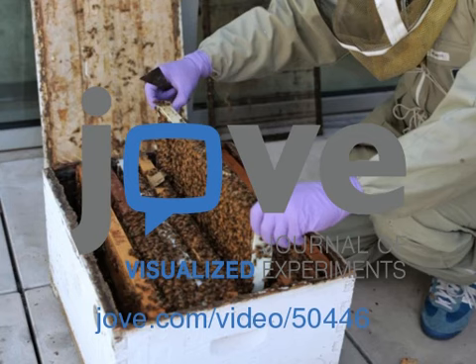While the bees are incubating, prepare a series of sucrose water solutions. Load the solutions into syringes with 15 to 20 gauge needles. For the PER assay, the bees are tested in groups. First, touch each bee's antenna with a droplet of 0% solution, which is water. After that, test with 0.1%, 0.3%, 1%, 3%, 10%, and 30% sucrose water solutions, allowing at least 2 minutes for the interval between each solution.